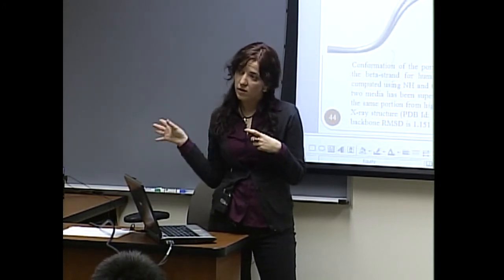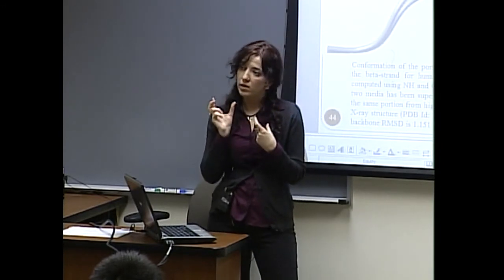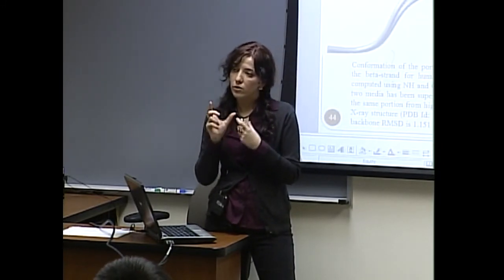Have you applied the algorithm to a longer sequence that, for example, has chunks of alpha helices and chunks of beta strands? Because the initial starting point, the first one you chose, was really related to alpha helices. In this one, it was a little harder to find the initial starting point. But what happens if you have these combinations, choosing the initial starting point and running through the algorithm? Have you looked at that? That part of the project is not implemented yet, but what we are going to do is divide the protein into a set of protein portions, to which we will apply the algorithm, and then we will use forward kinematics to connect them. So that's how we're going to do that.